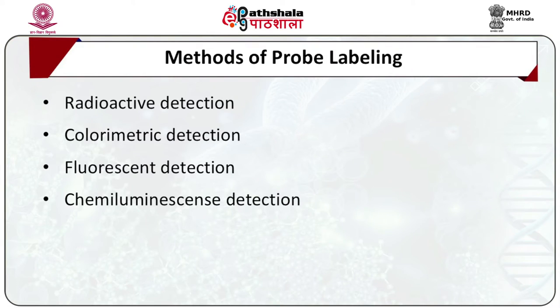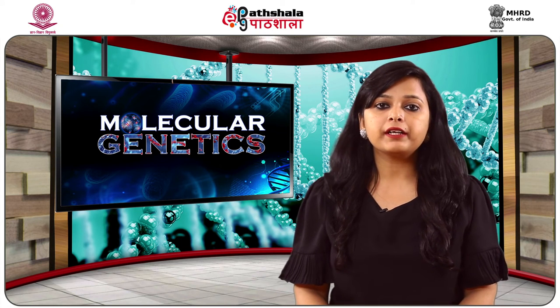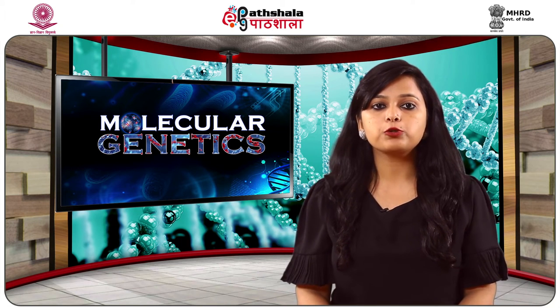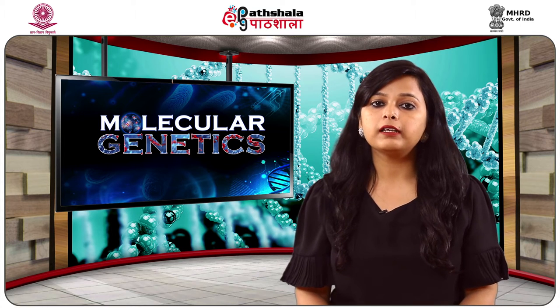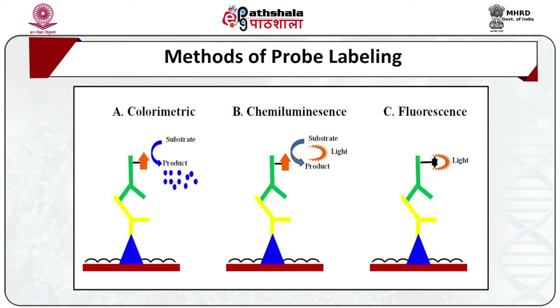Chemiluminescence detection is basically based on the outcome of an enzymatic reaction that leads to the discharge of visible light that can be detected. An example of this is the light emitted during a luciferase-catalyzed reaction.